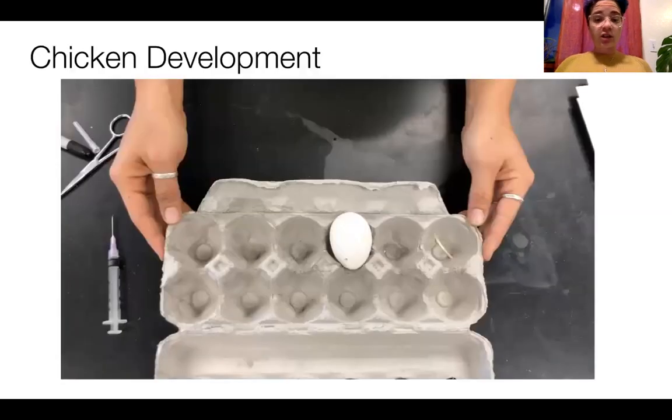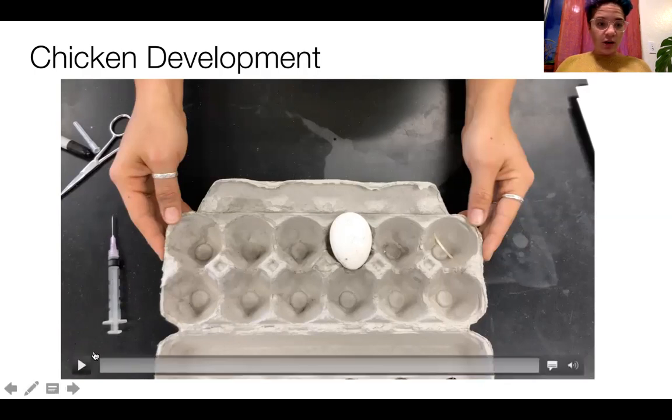Now we're going to go into cutting the chicken egg window. I've made a little video just because I feel like it's easier, and people seem to be more comfortable doing it when they see someone else doing it. So I've made a video that I will play now.